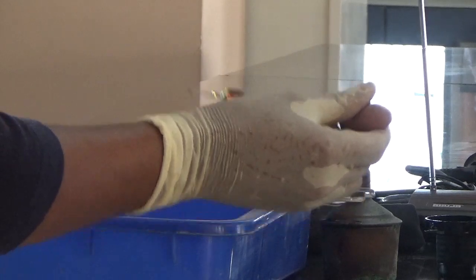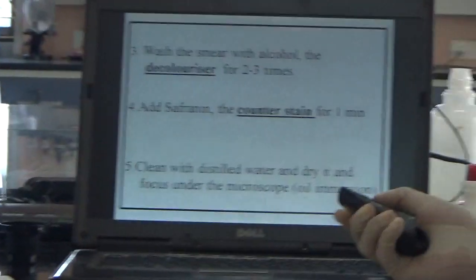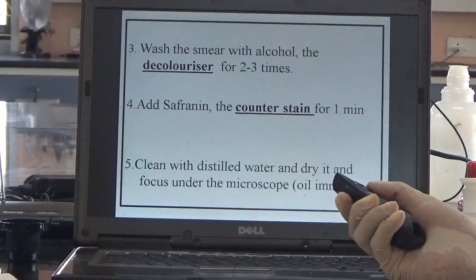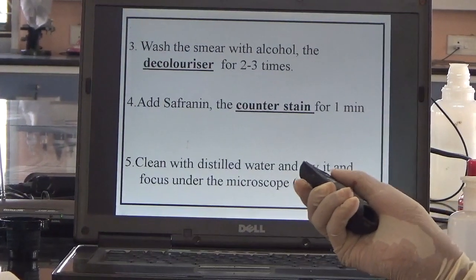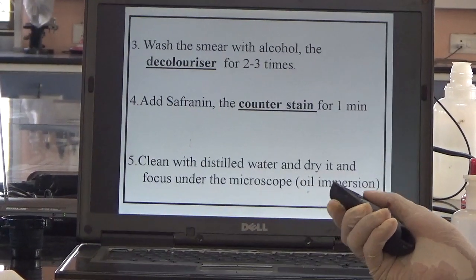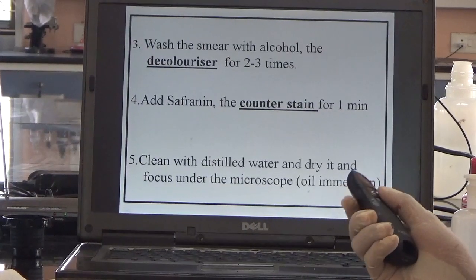Add 1 or 2 drops, then wait for 2 minutes. After waiting for 2 minutes, wash the slide with alcohol, which acts as the decolorizer. Wash it 2 to 3 times.